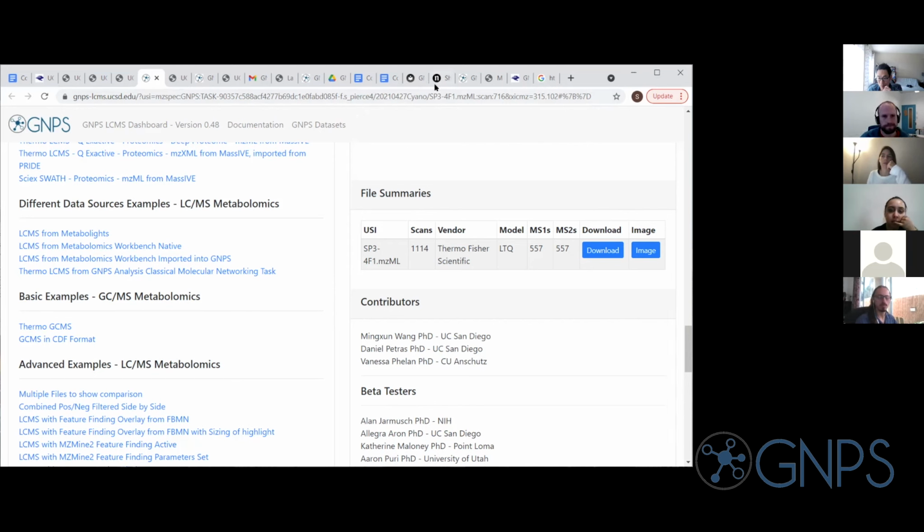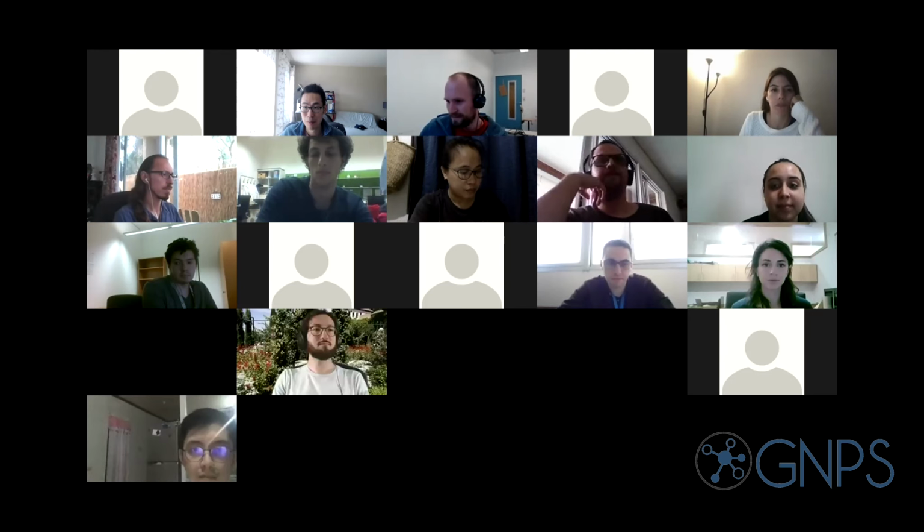Thank you so much. Sure. Also, I don't know if you want to look through it, feel free to stop by at the office hour, preferably on Tuesday. I'm happy to take a look at it. But yeah, any other questions?